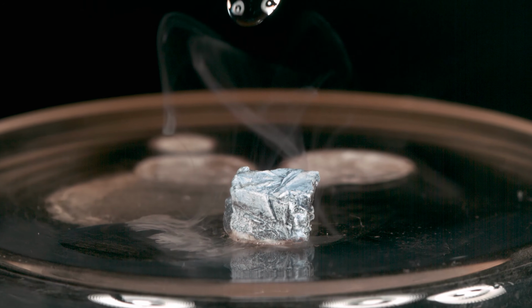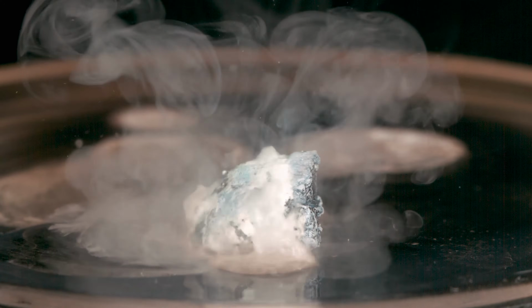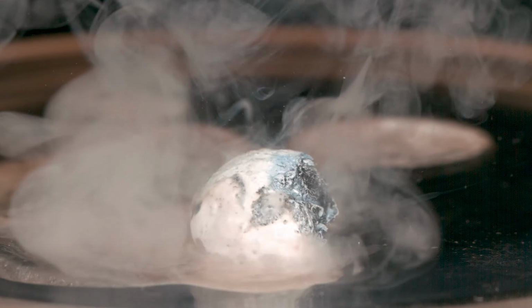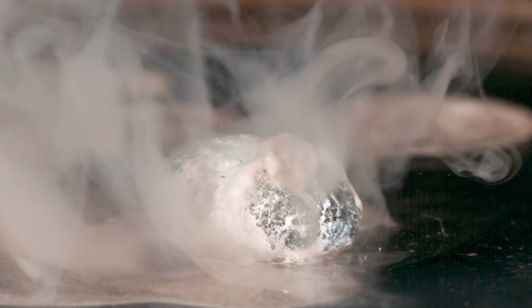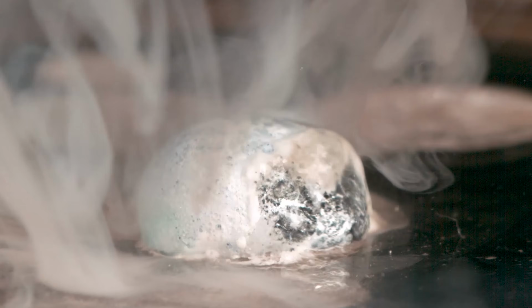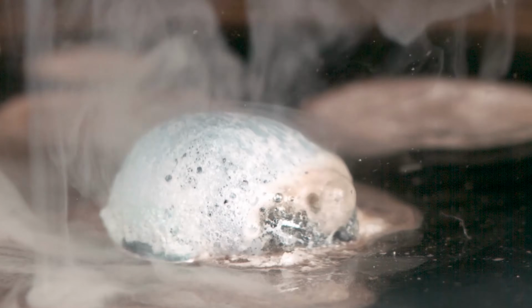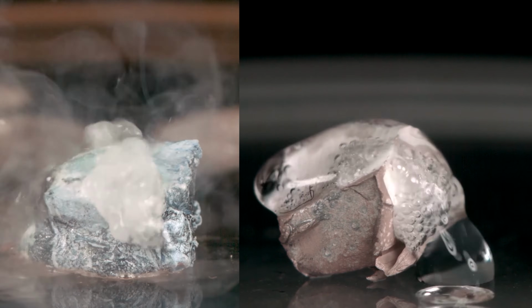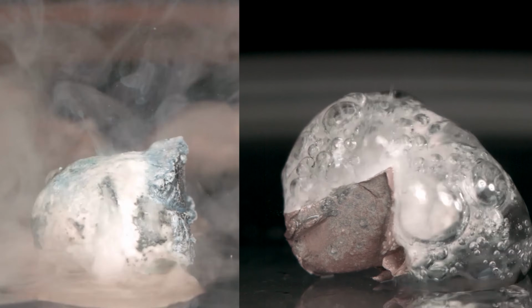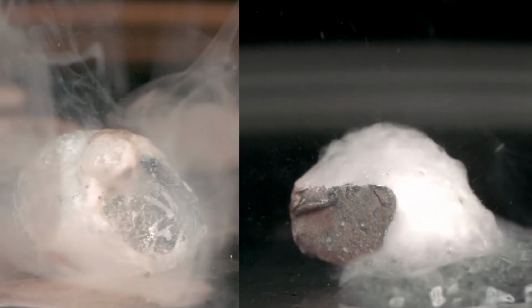Here, I want you to pay special attention to how fast it begins to react. We'll see that it's even faster than in the case of sodium, and also how fast it goes from a solid to a liquid molten state, again much faster than sodium. It basically goes from nothing at all to full-on molten reaction almost immediately. Here's a direct comparison between potassium on the left and sodium on the right. You'll see the potassium reacts immediately. It starts to melt. It's consumed in fumes and reaction products immediately and is much more reactive than sodium.